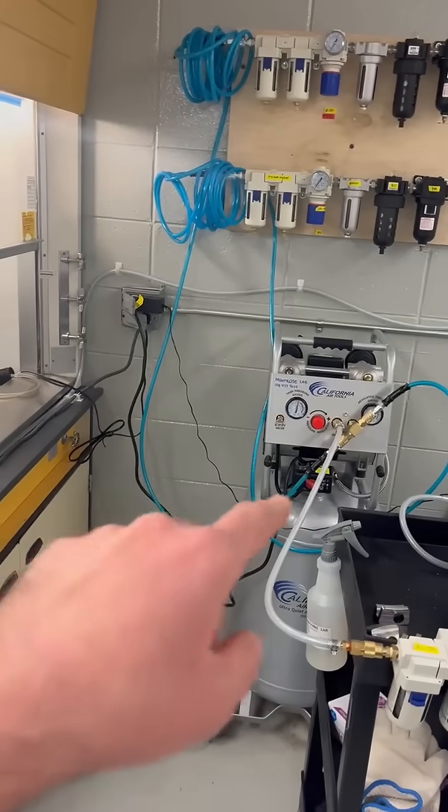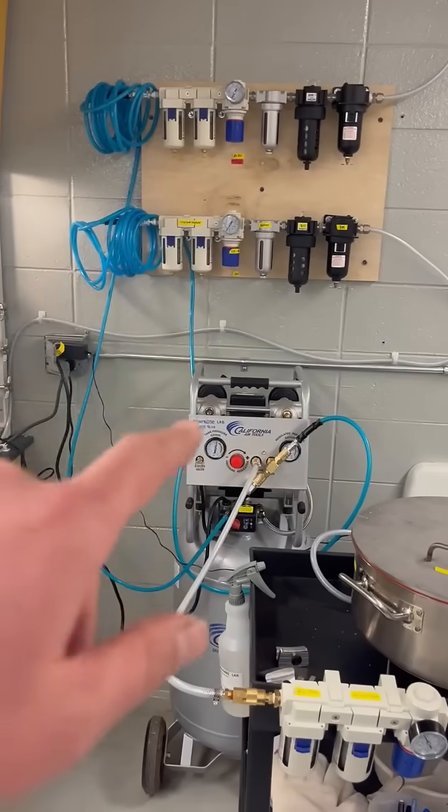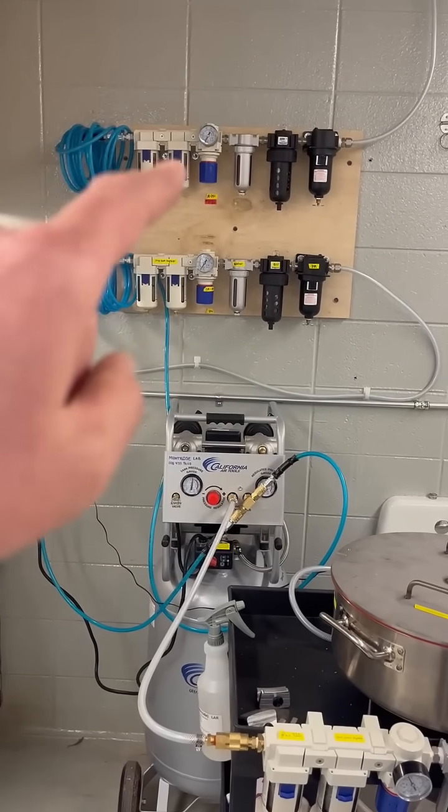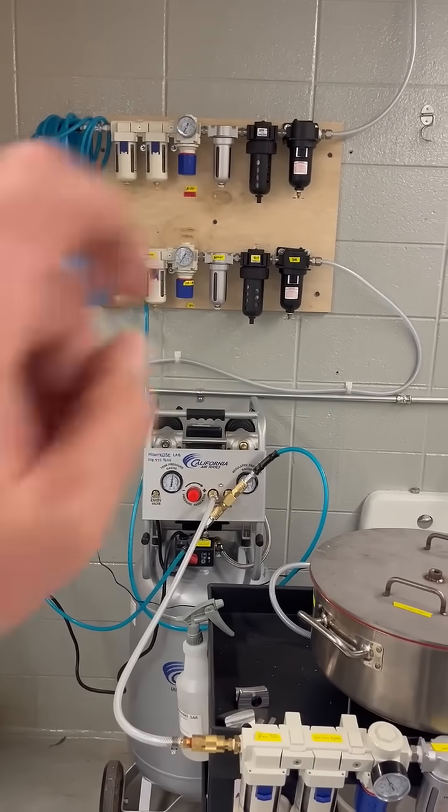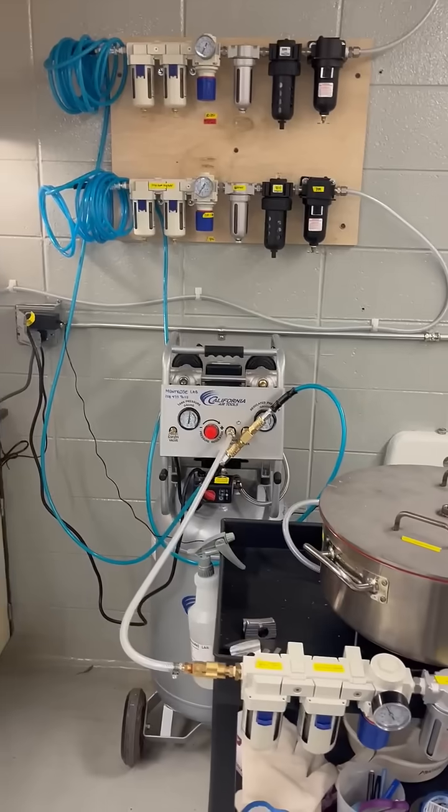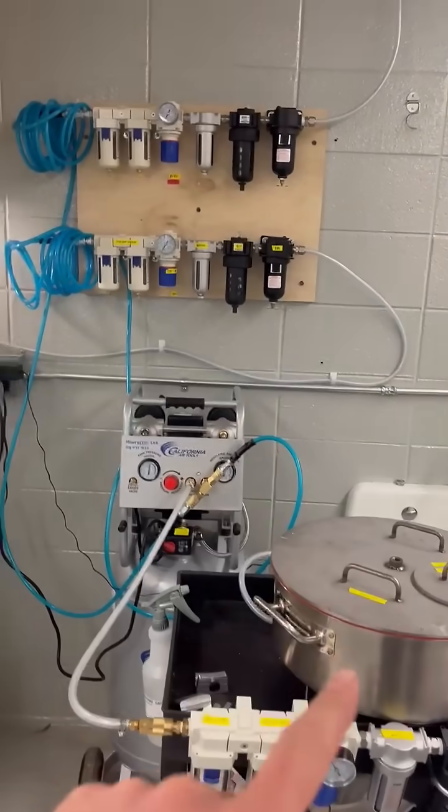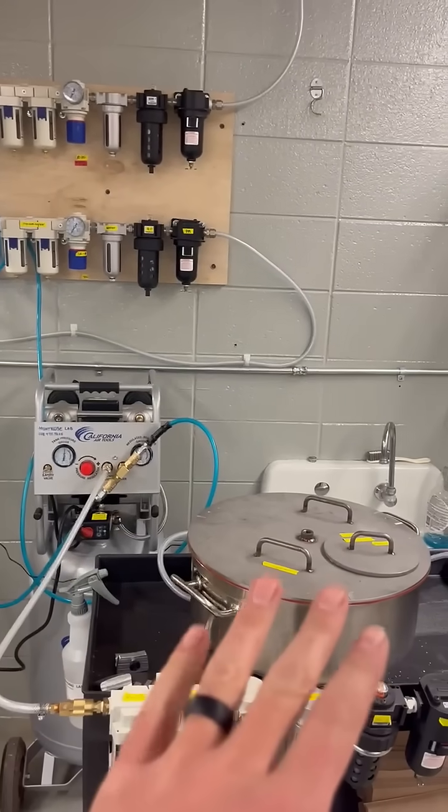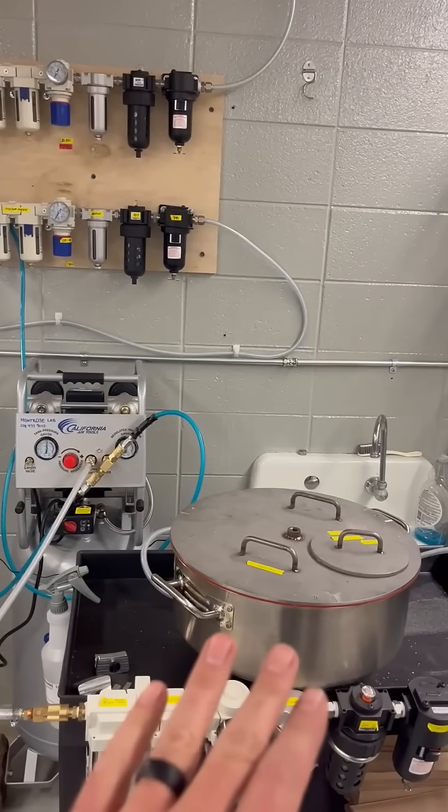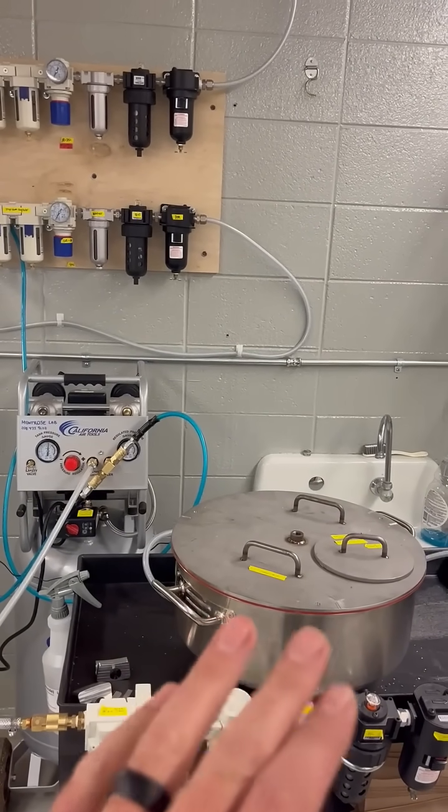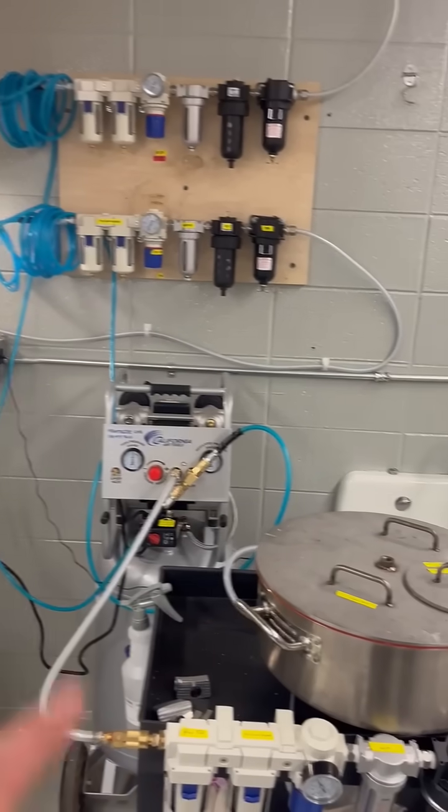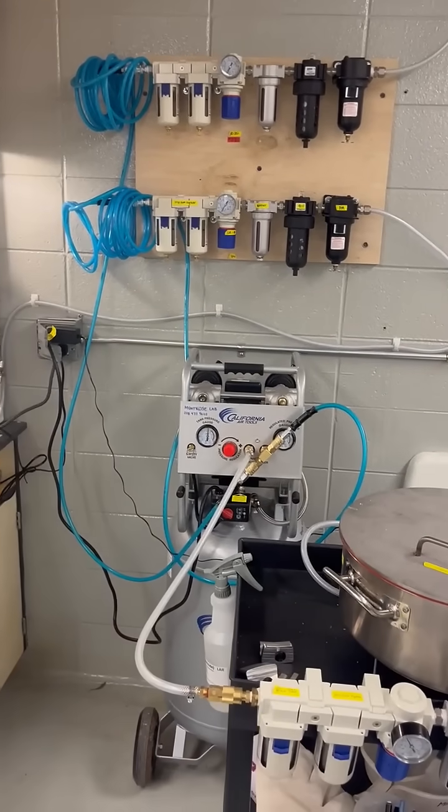The air that comes into the system is conditioned so that we remove particulate oil and water from it and we set this experiment up so that there's an exposed and a control so there's this whole set of mice that the only thing that they receive is the stimulus of being put in and out of the exposure chamber and the noise of the air compressor.